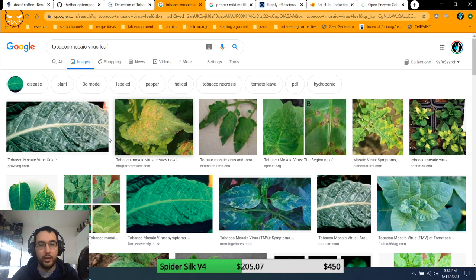So PCR, I've done a whole video on PCR. If you don't know what it is or how it works, I'd highly suggest giving that a watch. It's got all nice animations and stuff. But the long and the short of it is basically what PCR lets you do is if a certain piece of DNA is present in the reaction, you end up with millions and millions. The reaction makes millions of copies of that one little fragment of DNA to the point where you'll get a band on a gel. So actually, you know what? I can show this to you on Instagram.